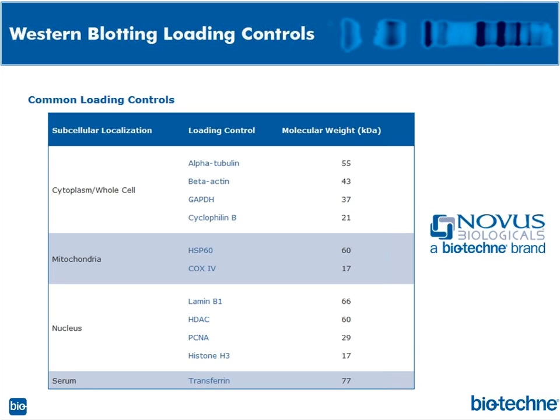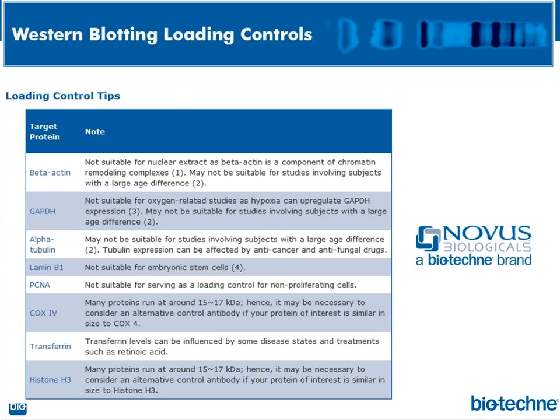The second thing that folks need to consider is the experimental treatment. So if I'm using a cytokine or a chemokine or some kind of protein from, say, R&D Systems, and I'm treating my cells to stimulate them, which is very common for us. People deal with R&D Systems all the time for recombinant proteins. We work with them all the time.